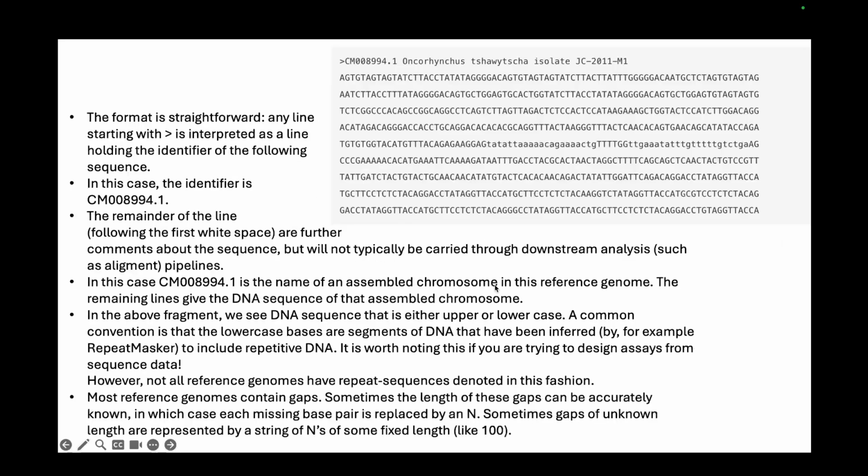Okay. So this was the FASTA format. A few key things to keep in mind. It's just showing you the sequence of your nucleotides in the genome. On the top, you have an identifier, along with certain other information added to it. What species is it coming from? What kind of chemical treatment have you done with it? Maybe some part of it you have isolated, and that sequence is what it is representing here. So this kind of information you put in the first line, and from the next line you have all the sequences. And in those sequences, you can do masking or no masking depending upon your requirement. But this is how the format looks.